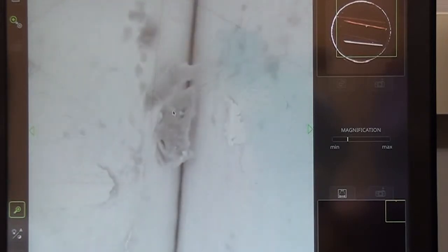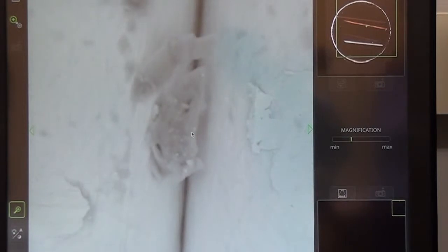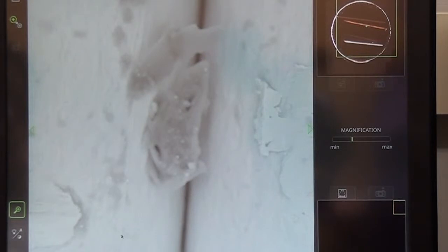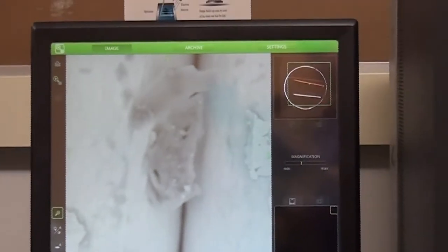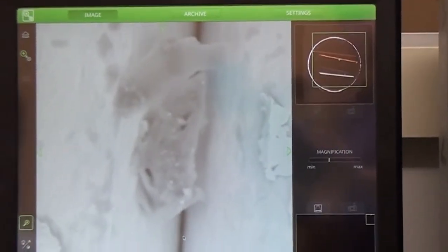Let's zoom in some more here. We can see little dents, some bridges, some tiny layers here. The magnification is almost 3,500 and the voltage is 15 kilovolts point volt.